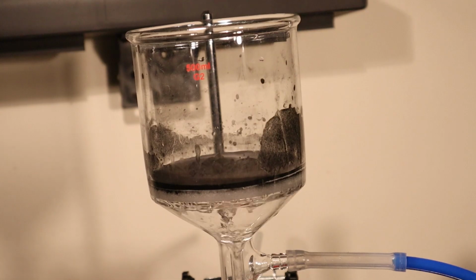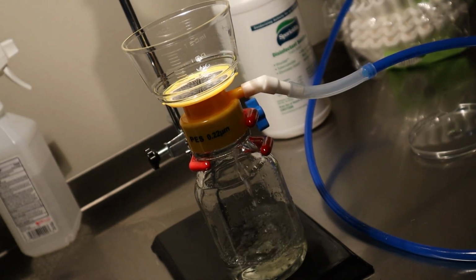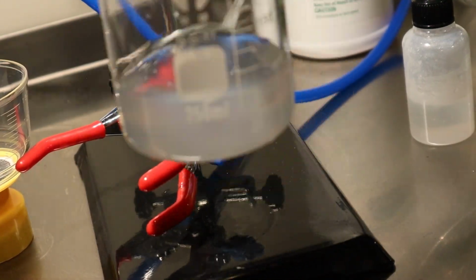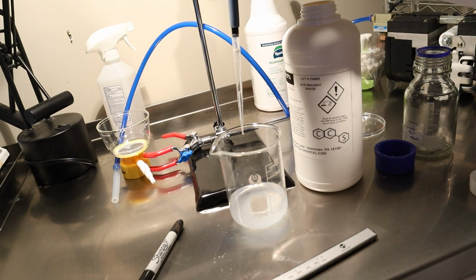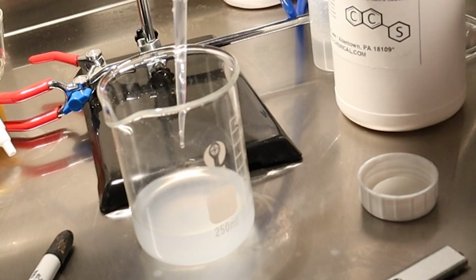and filtered it again through a 0.22 micron filter because it still looked like it had some charcoal inside it. I was now supposed to neutralize the acidified methanol to pH 6 or 7. So I got out my dropper bottle and carefully did so, and when I overshot it, I fixed it with some hydrochloric acid, which was kind of scary seeing smoke when it hit the beaker.